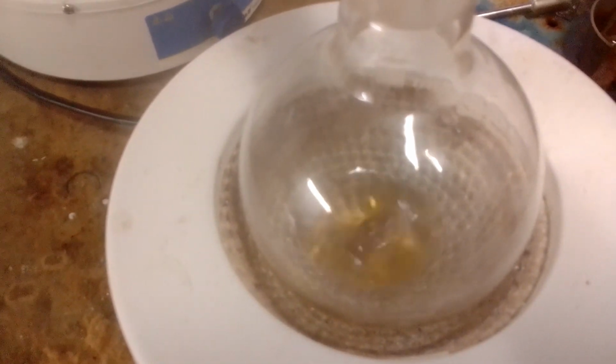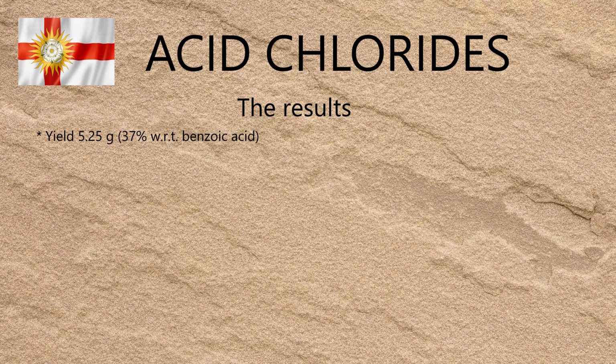and a characteristic smell much like that of marzipan, with subtle top notes of chemical warfare. The yield was 5.25 grams, which is 37% with respect to benzoic acid. Compared to the 80% reported in the original paper, this is frankly terrible.